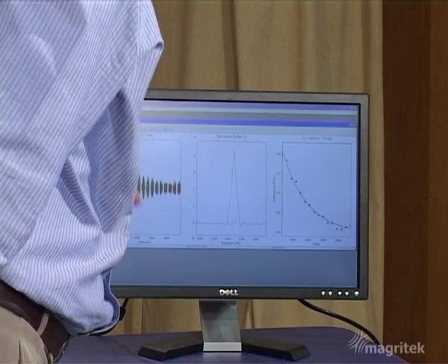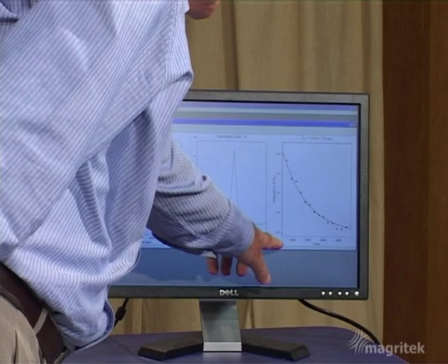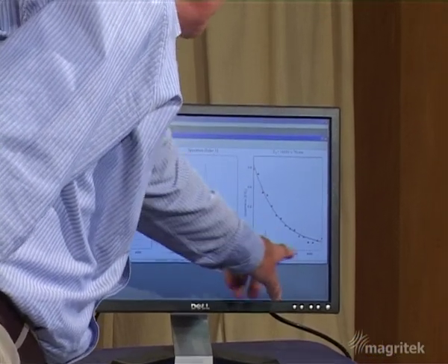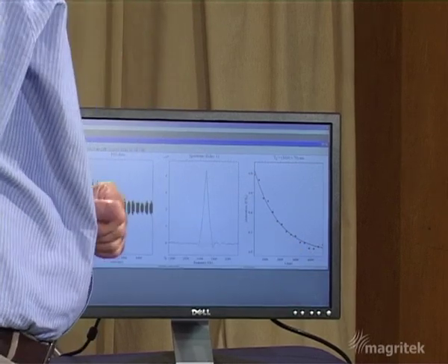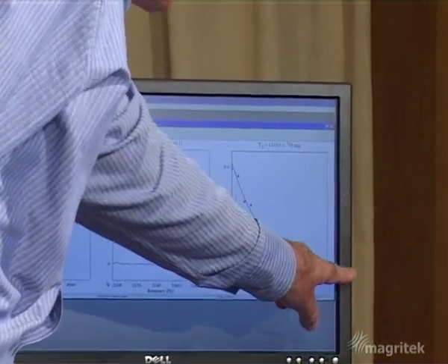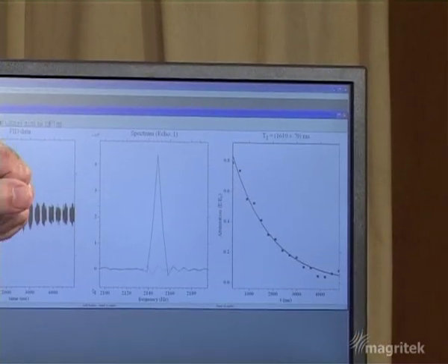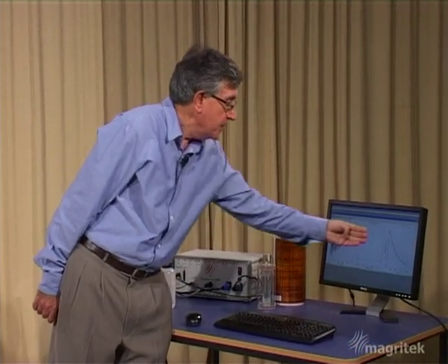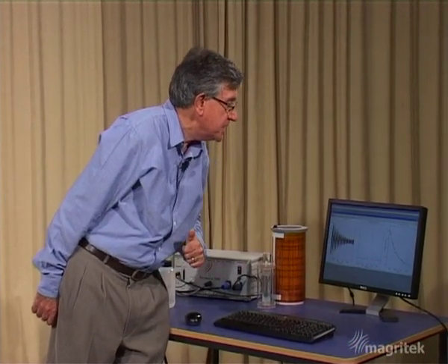On the right-hand side we see the areas of those spectra obtained at different echo times, plotted as a function of time. The scale goes from zero out to about five seconds, and you can see the decaying away of the echo amplitudes with increasing time. Once again we've fitted a single exponential to that data, and the time constant for T2 is around about 1.6 seconds - again a very typical value for water molecules.